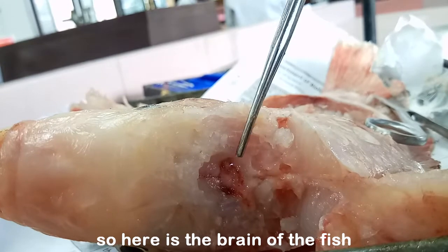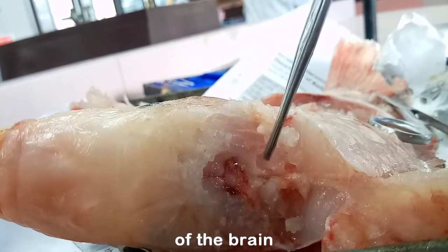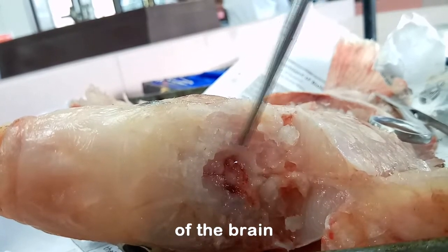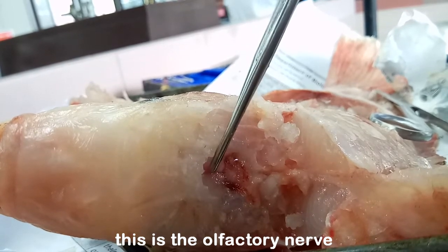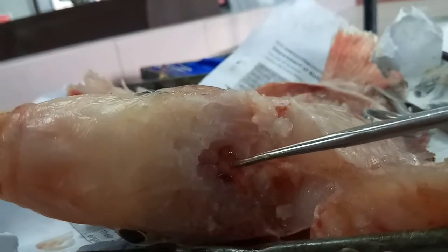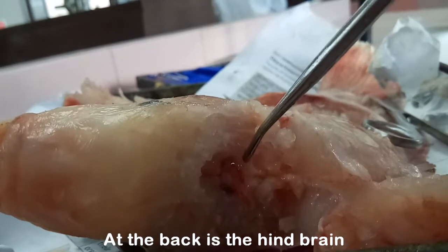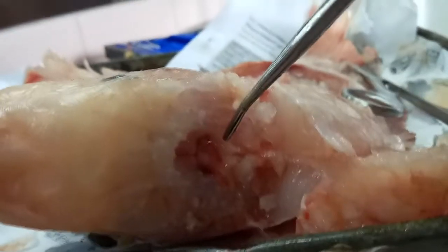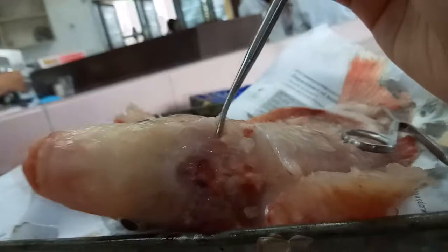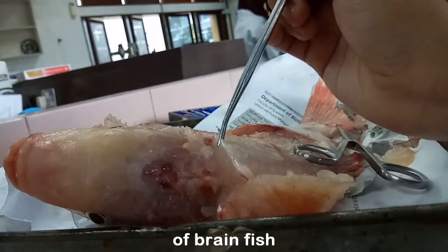So here, this is the brain of the fish. We are going to check the structures of the brain one by one. So this is the spinal cord, and then this is the optic nerve of the brain, and this is the olfactory nerve of the fish brain. This is the midbrain, the true brain of the fish, and then at the back is the hindbrain, and in front of the brain is what we call the forebrain. So basically this is the structure of the fish brain.